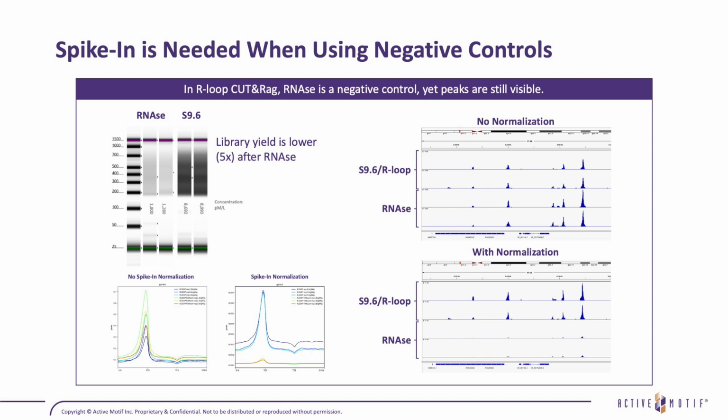Well, those open chromatin regions would overlap with ATAC-Seq data. Of course, ATAC-Seq data overlaps with the promoters of H3K4me3 marked genes. And then R loops, which also control gene expression, are basically in the promoters of most transcribed genes. And so that's why we think we're seeing peaks in the same locations.